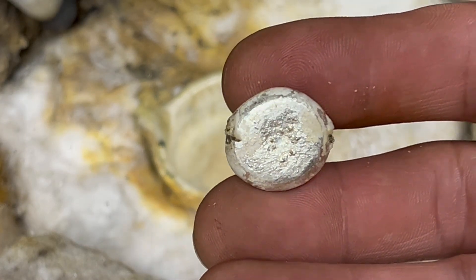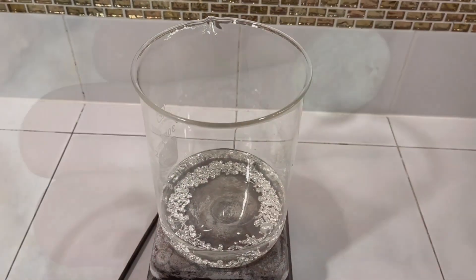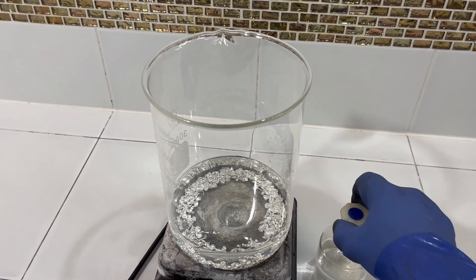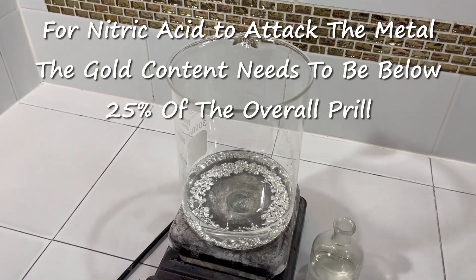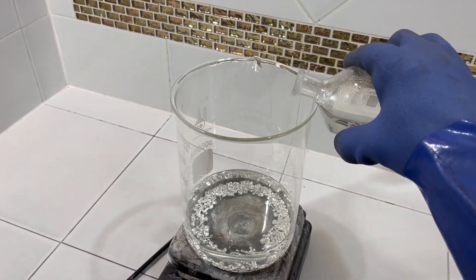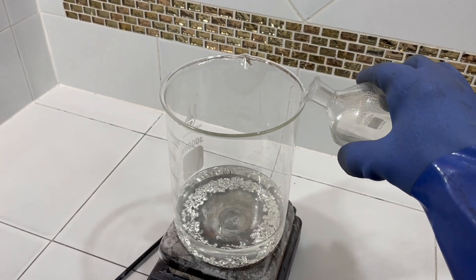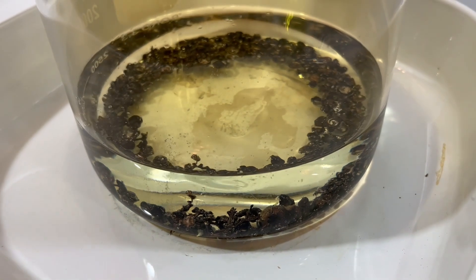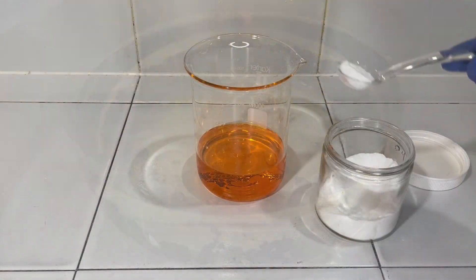I recommend adding equal parts of either copper, silver, or 925 silver. You will need to melt a second time and pour some shot. That shot can then be dissolved in nitric acid. When that process is complete, all of the gold will dissolve in aqua regia, and we're back to refining.